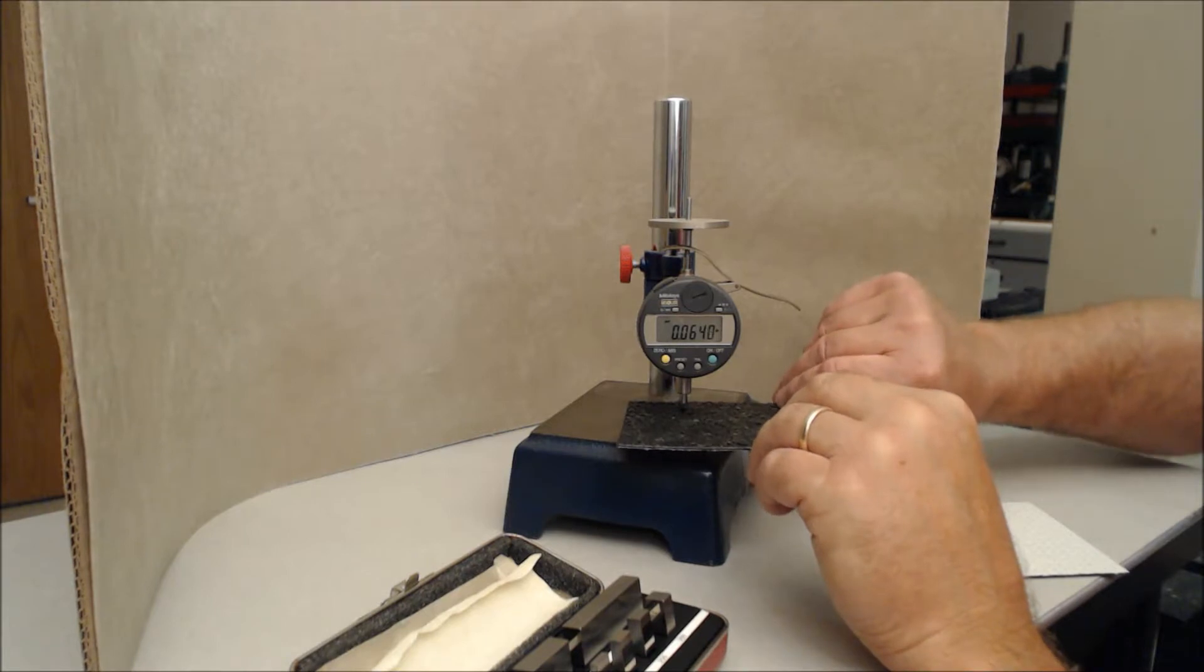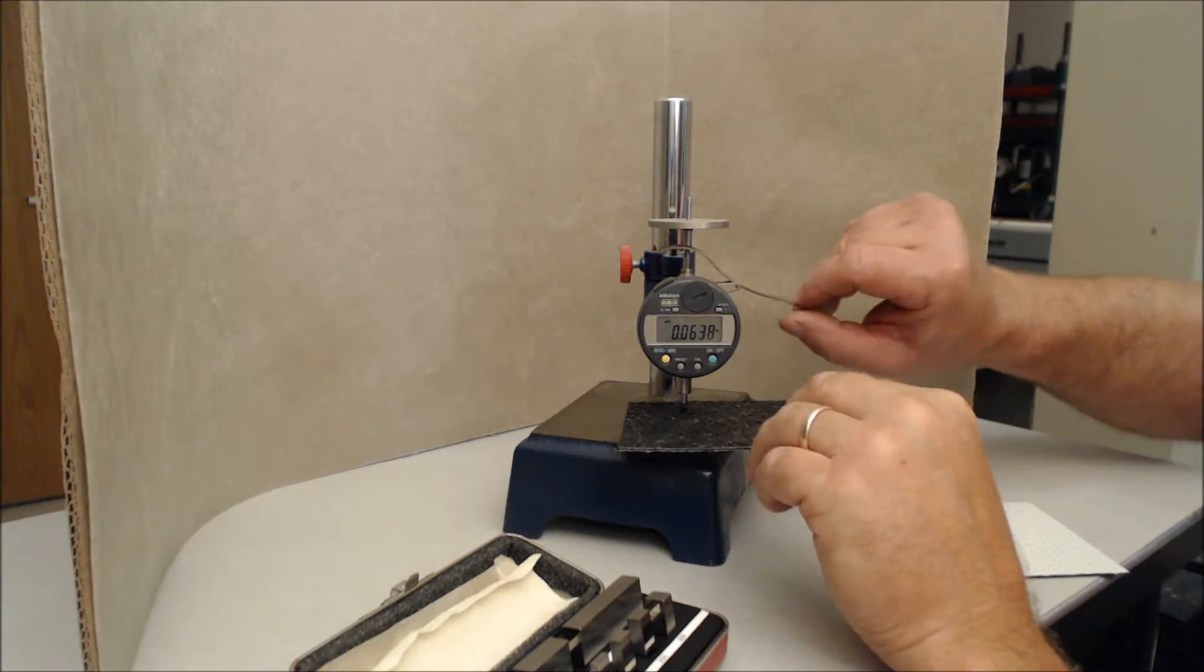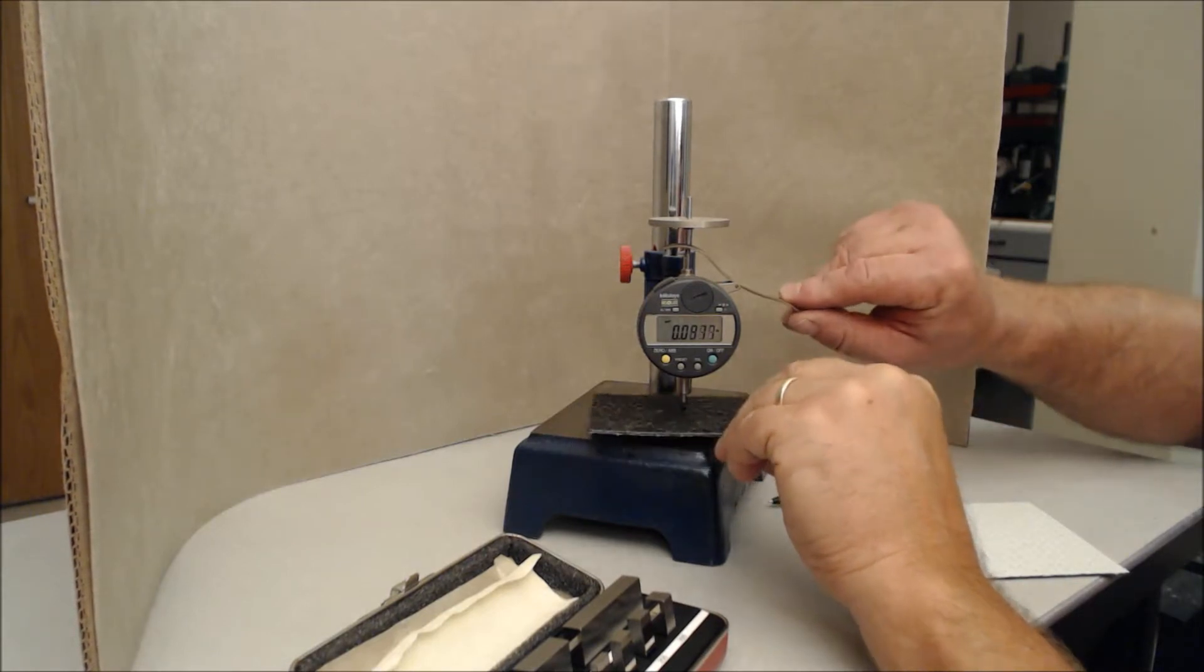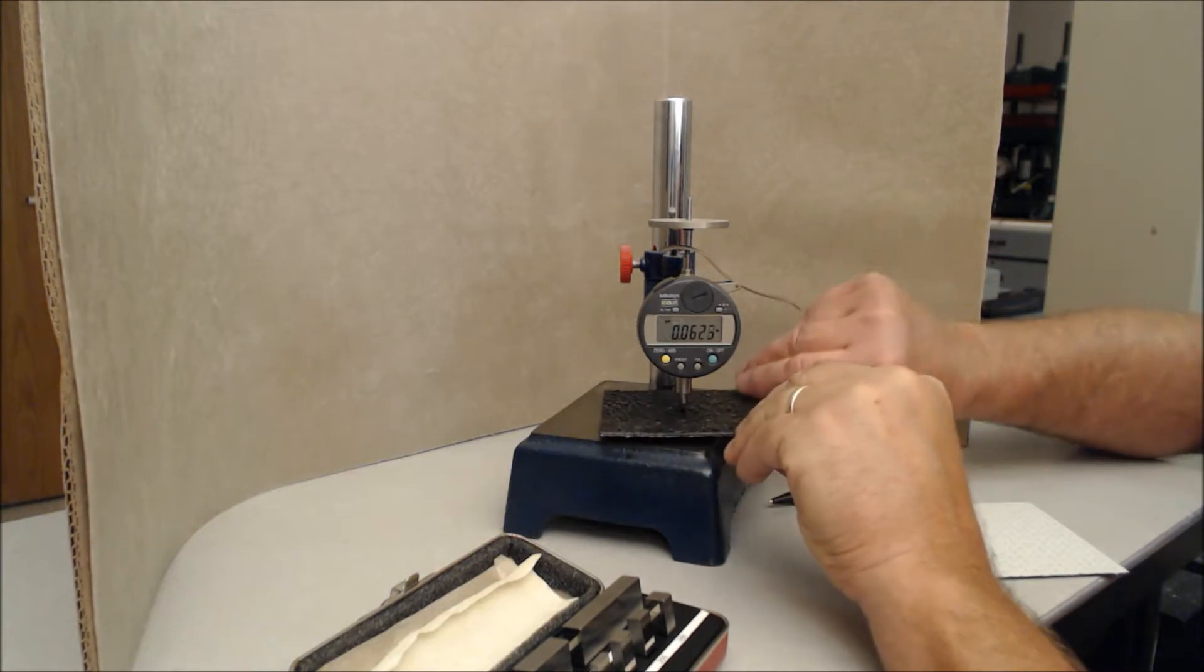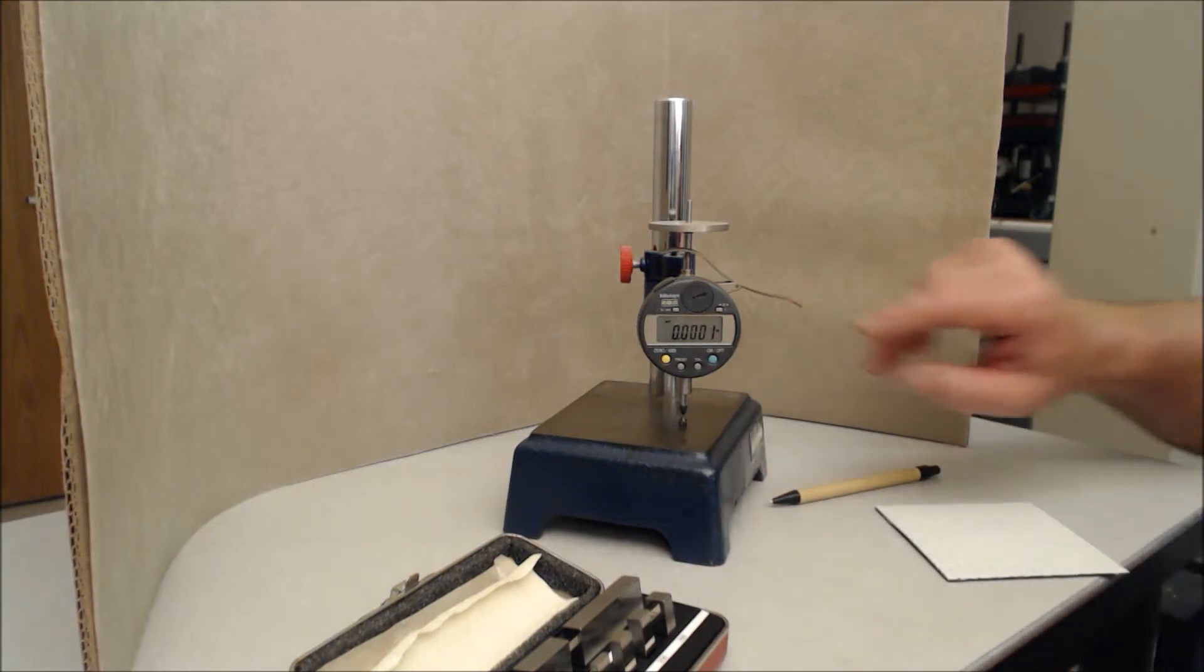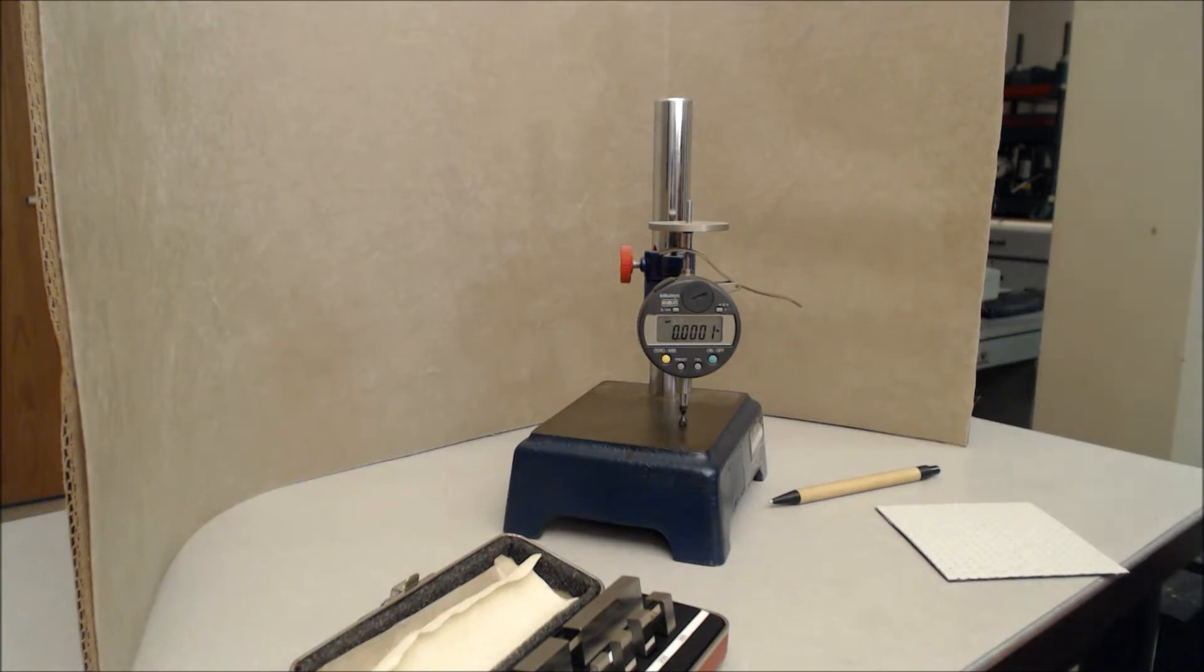Here's the first reading, and the lowest I got, I saw a 63.7. The second reading, I'm reading a 62.9, and the third reading, I have a 62.1. So I would report the lowest value, which would be the 62.1 for the reading.